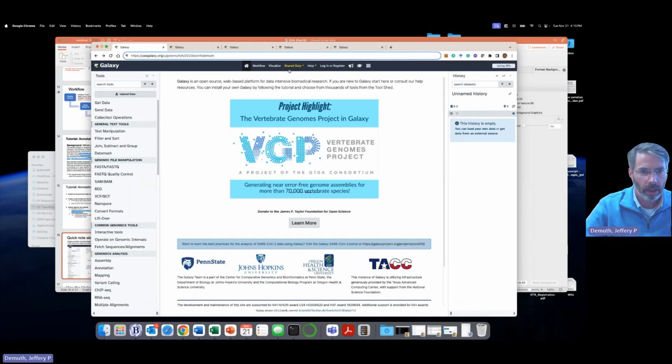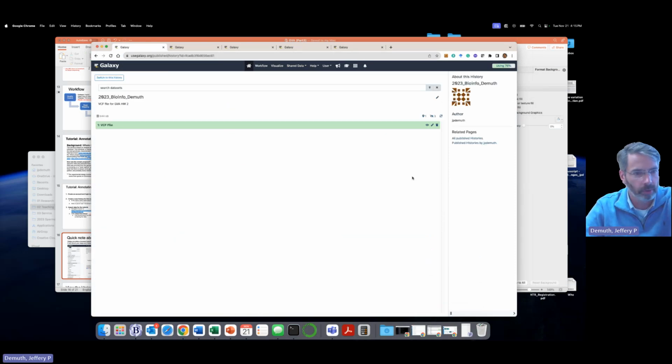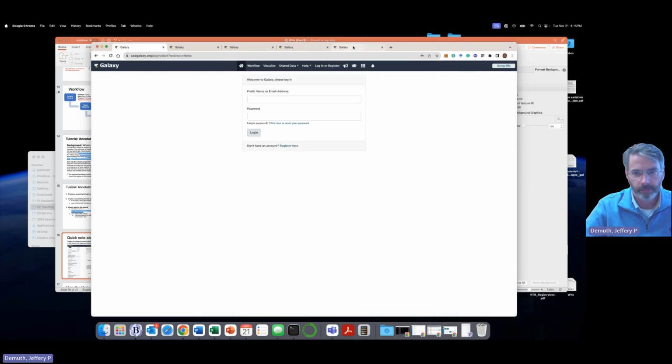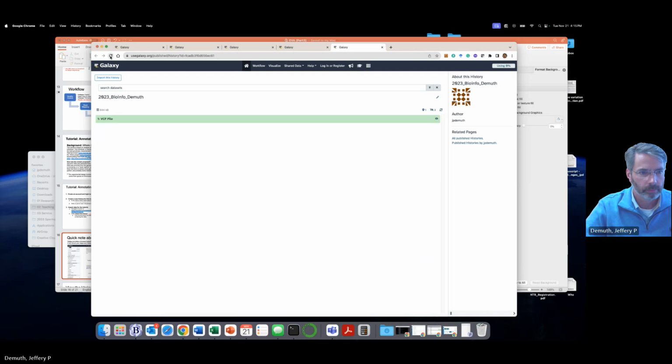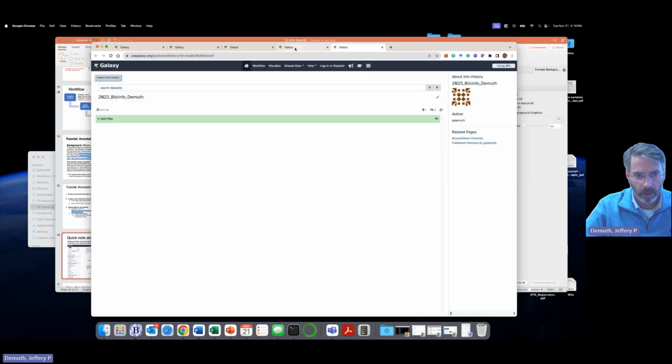Okay, so if you paste in that URL, it should, hopefully for you, link straight to it. Because for me, since I'm logged in as me, it is not letting me. There. So when I logged out, which you won't be since you won't be logged in as me, you'll see this icon to import this history. And that will give you an opportunity to import that into your history.